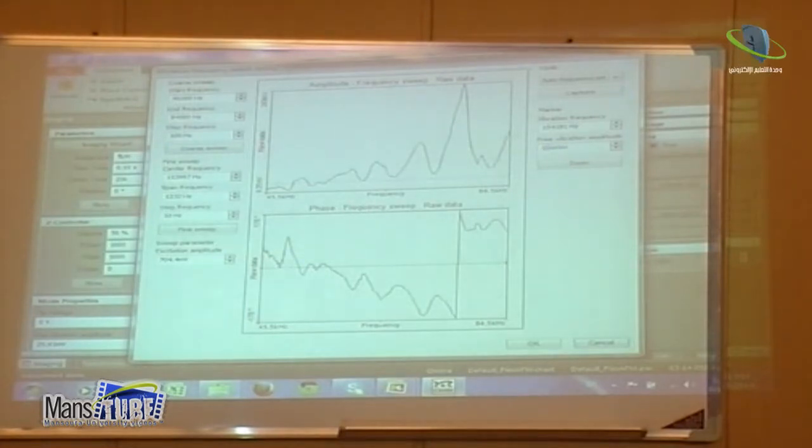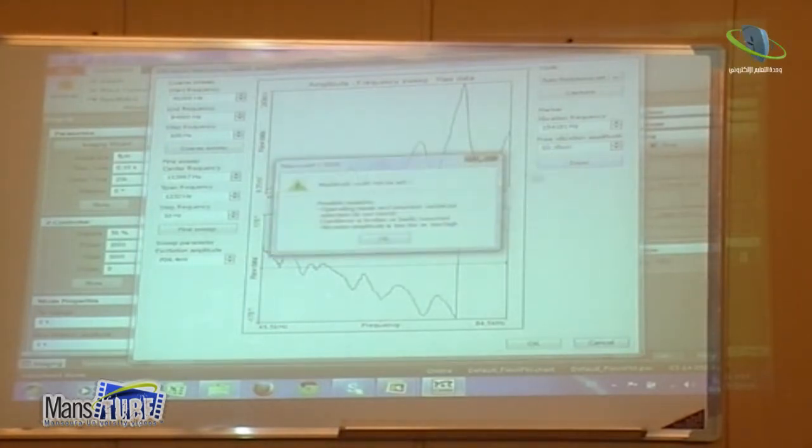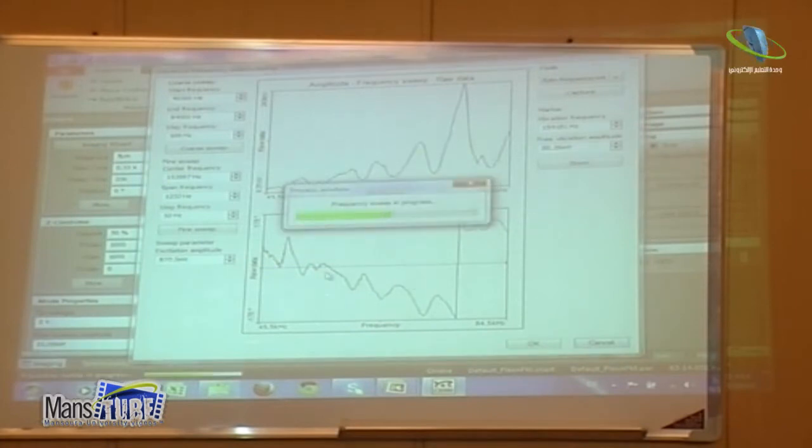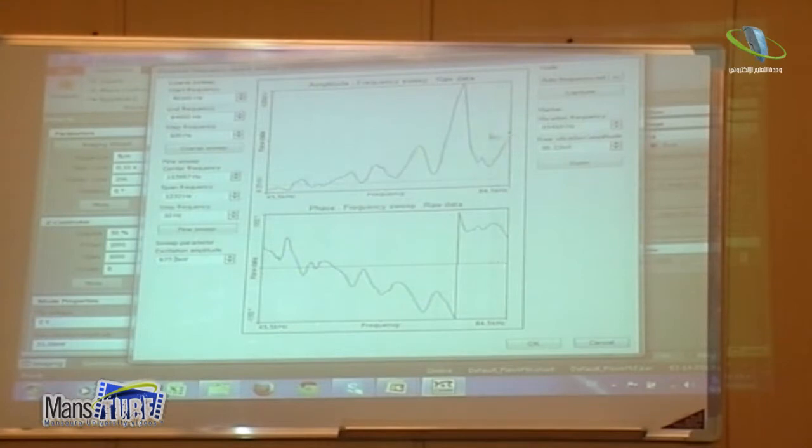Let's try 1000. So you can see this is okay, and then you can say this is maybe my maximum peak. Every time it can give you different kinds of peaks. And what also happens is that the frequency here is about 77 kilohertz, and in air it's like 150, 160. Usually it's divided by 2 or 3, because in air it's different than in liquid.